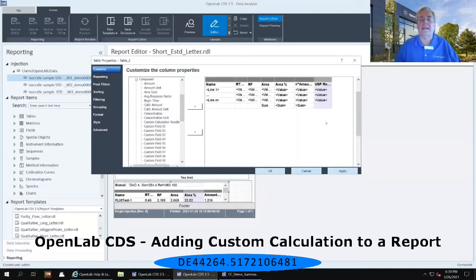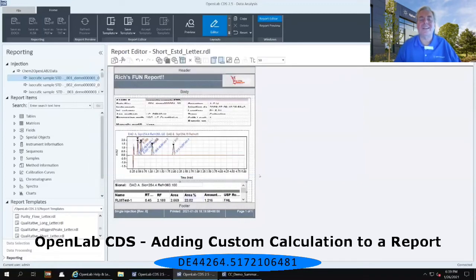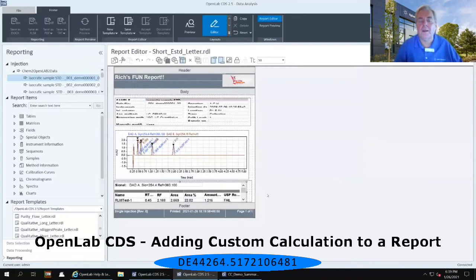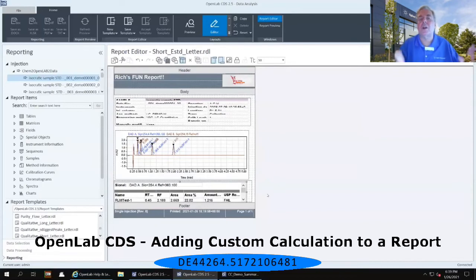I can click OK, and notice that even before I preview that report, it shows me that my new column has appeared, and it even starts filling in some of that information for me.